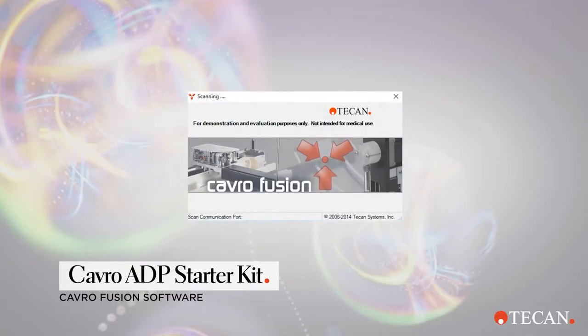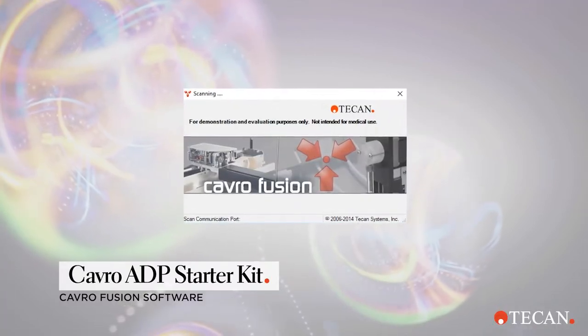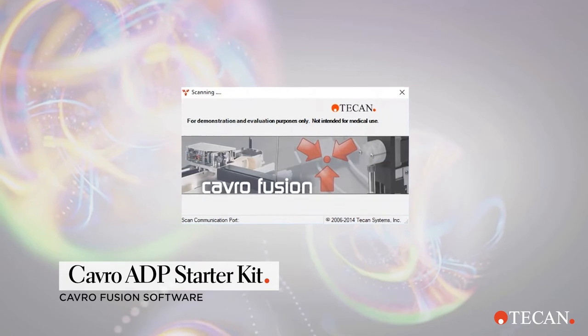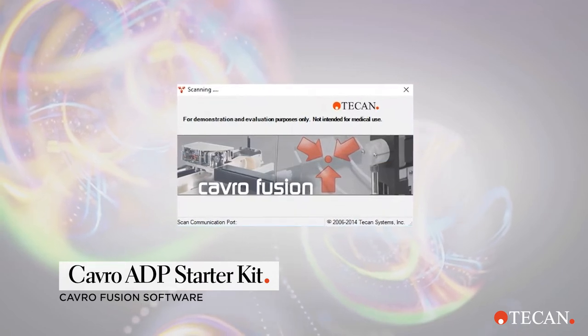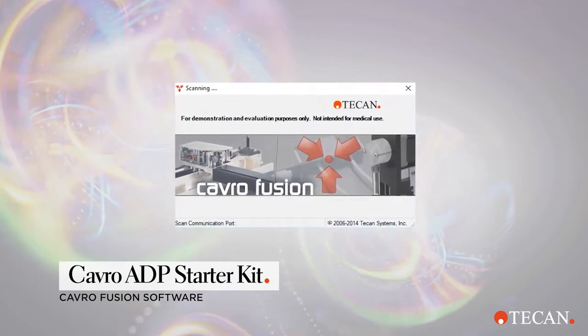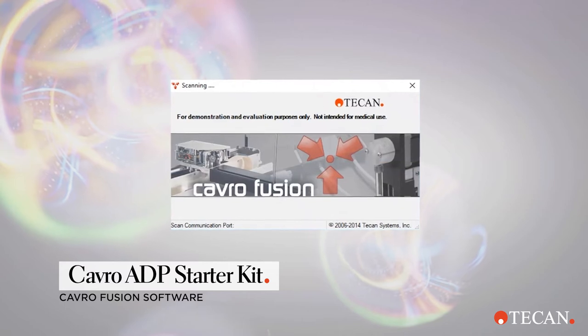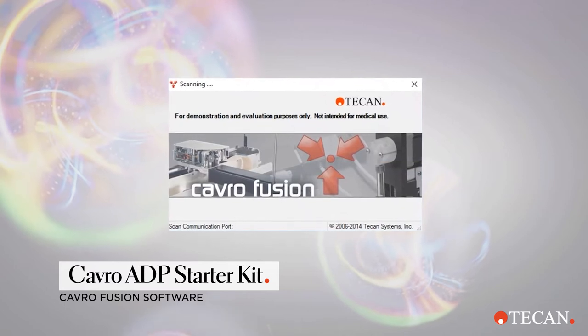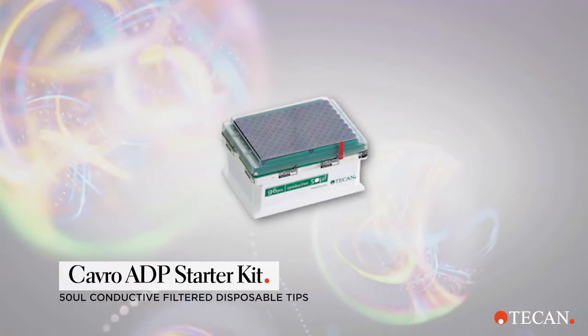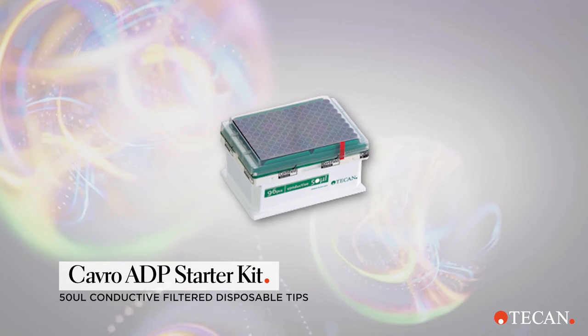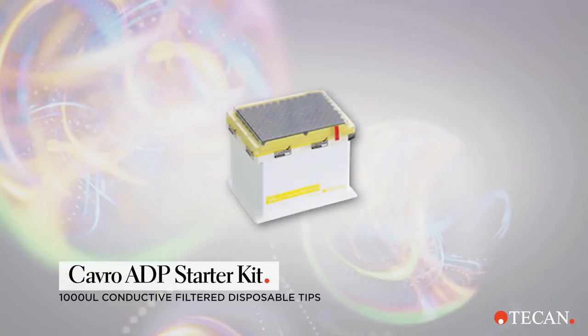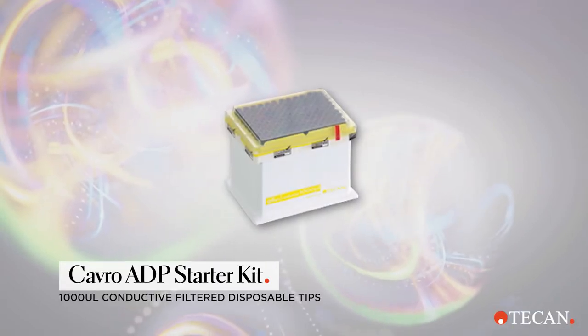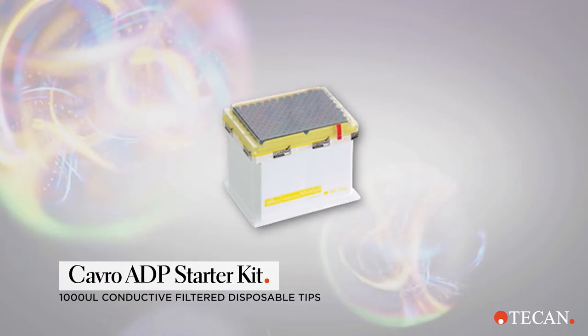It also comes with the CAVRO Fusion software. The CAVRO Fusion software provides you the ability to easily connect to and operate TECAN CAVRO modules through any Windows-based PC. And finally, 4 packs each of 50 µL and 1,000 µL conductive filtered TECAN disposable tips.